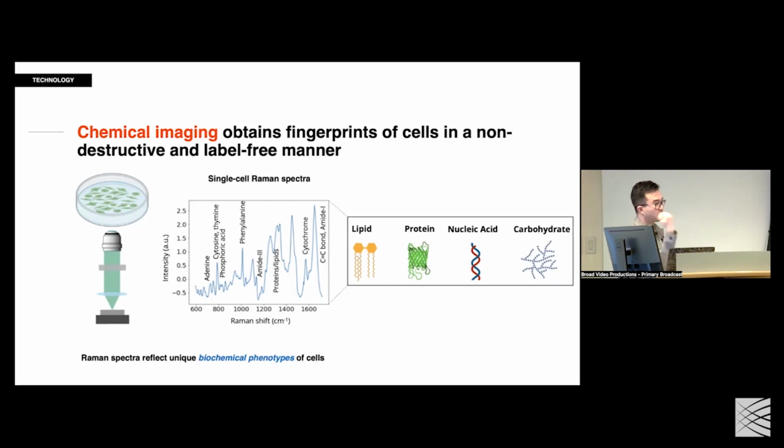And then you capture the scattered light, and then you will get a spectrum per pixel. But this spectrum is high dimensional, up to 1,000 peaks. Think about fluorescence, you have 5, but this has 1,000. And then it's a composite measurement of every molecule inside of cells, versus measuring RNA. You are measuring lipid, proteins, nucleic acid, and carbohydrate inside of a cell all at once. But it's a composite measurement. We're not measuring each individual molecule.